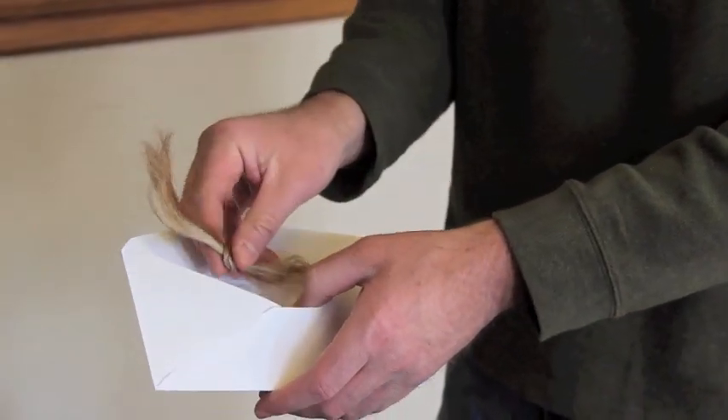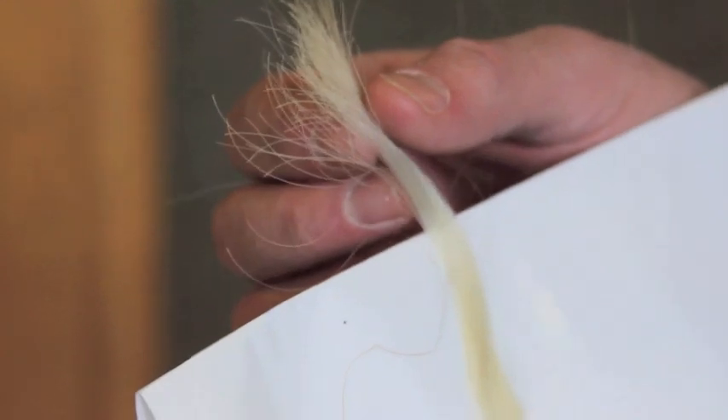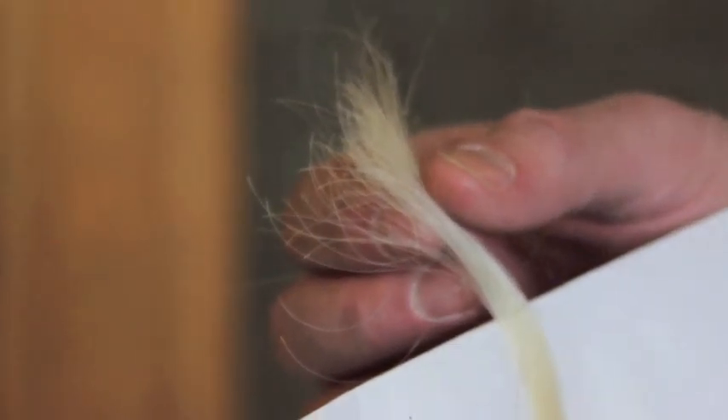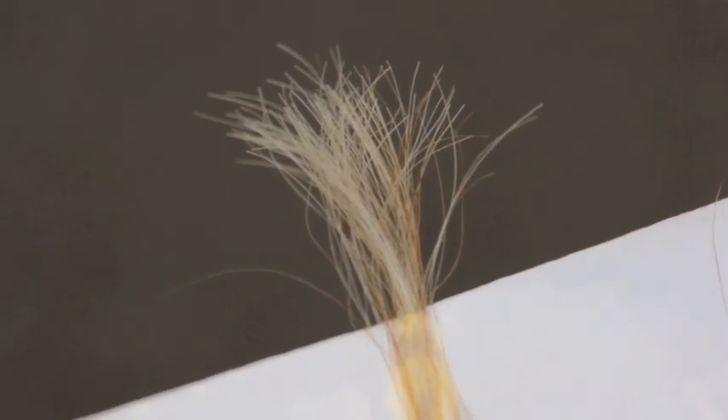You can then place it in a paper envelope marked with the animal's ID. But be careful of how you store your sample. The paper envelope is ideal because it minimizes bacteria growth. A plastic bag is a perfect place for bacteria and mold growth to form, thereby compromising your sample.